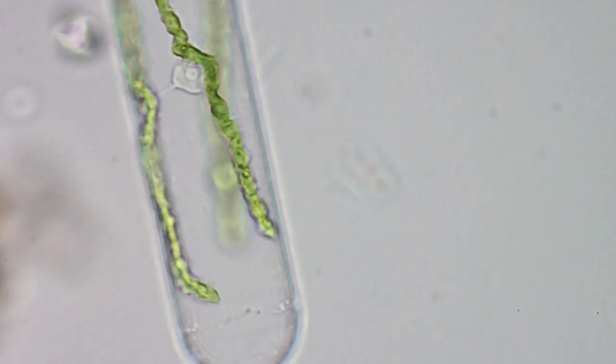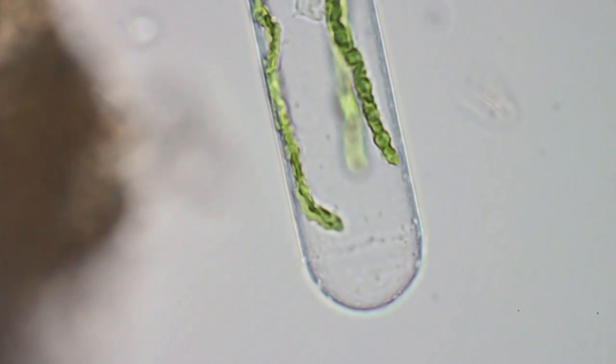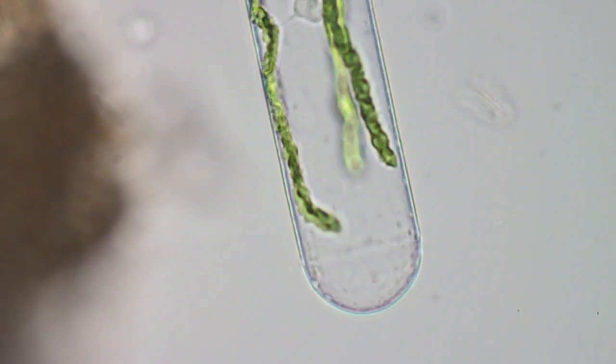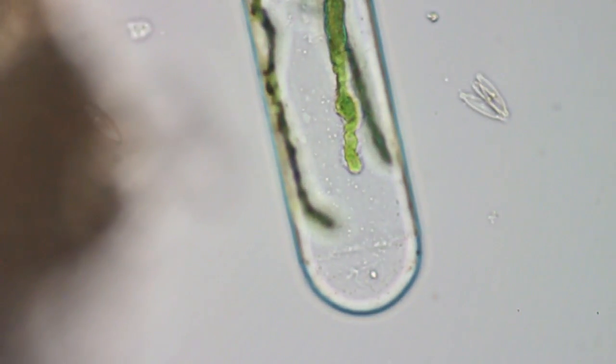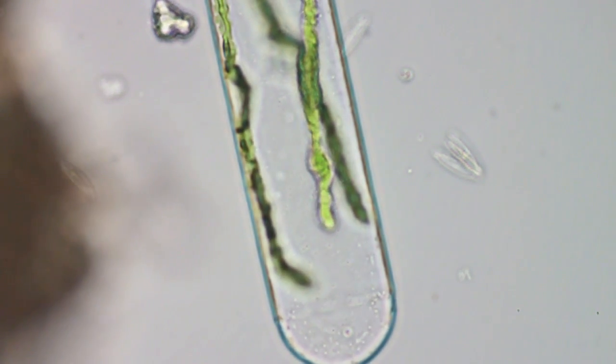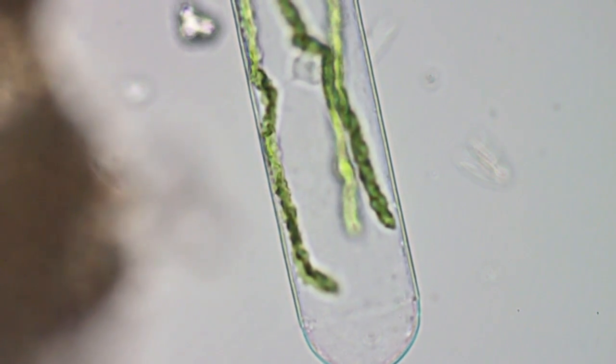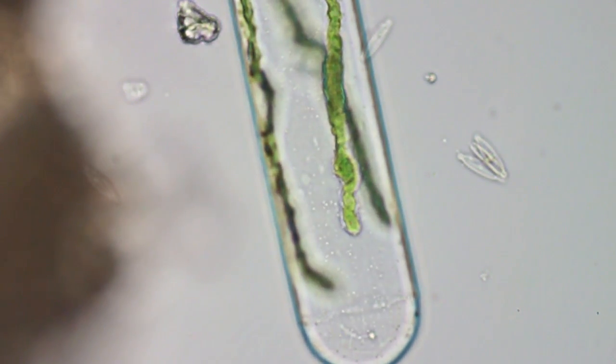And here we are at 40x, using a Nikon 40x plan apochromat lens - another fairly nice lens. You can see the diatoms on the right there. You can also see the cell walls inside the spirogyra.